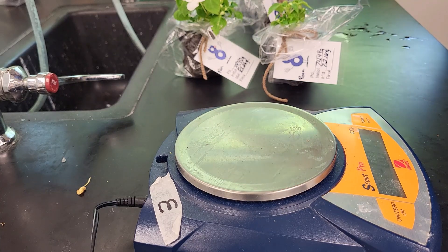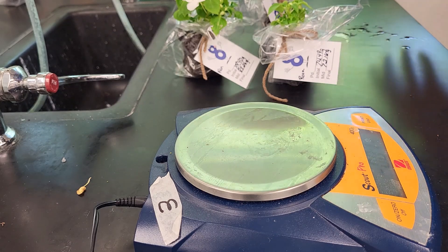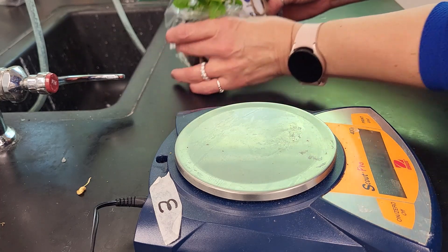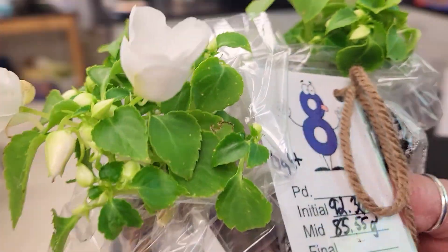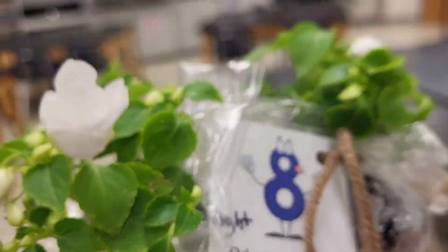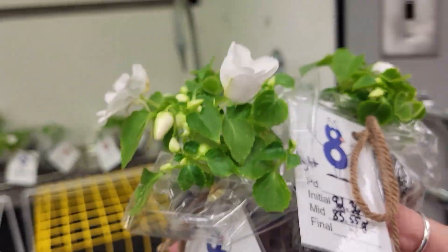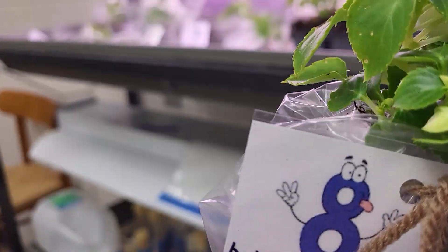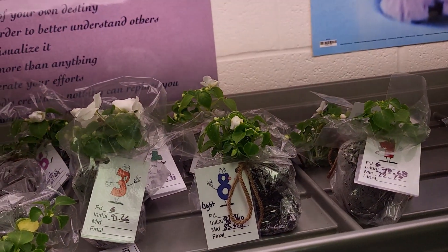We're going to put those plants back again. The mist one stays on the counter, the room condition plant stays there too. We'll take the other two back — one to the fan area and one to the light cart — and let them sit again until next class period.